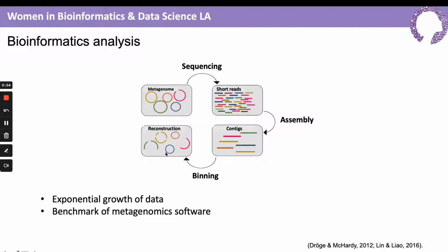Next-generation sequencing has allowed the exponential growth of data from metagenome studies. Therefore, it has been necessary to improve the computational methods for this data interpretation. Despite the fact that multiple software have been developed with the purpose of reconstructing the original metagenome, it is still necessary to focus on comparative studies, benchmarking, to determine software capability for the reconstruction of the original scenario.